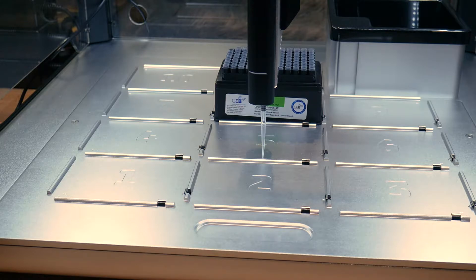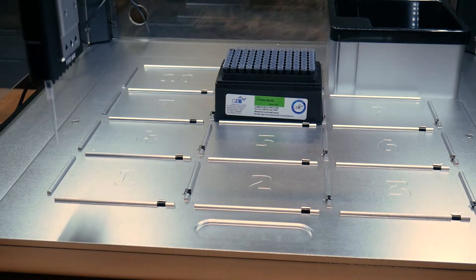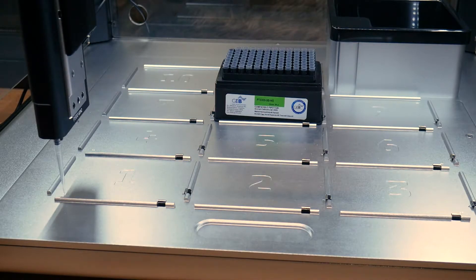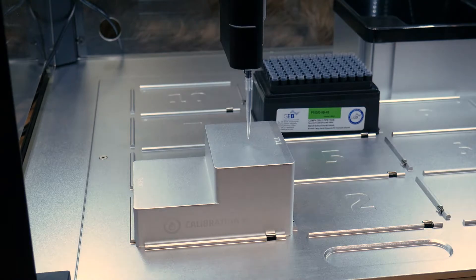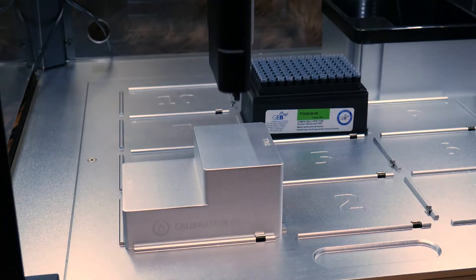To perform the deck calibration you just need to move the robot to four different positions on the deck using the arrow keys on your computer. The OT-2 is a quick learner. After that you'll do a pipette and tip calibration to teach the OT-2 about the specifics of the pipette and tip combinations you're using. All in all you'll be ready to run your first protocol in about 10 to 15 minutes when you first power on the robot.